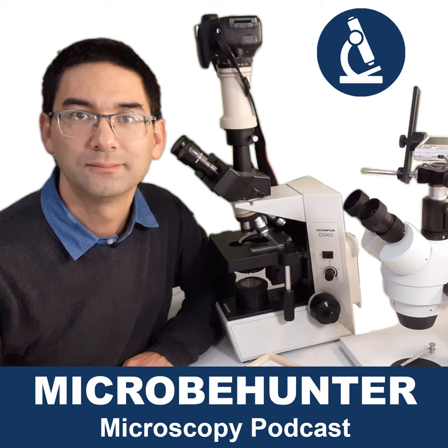I remember a talk I once had with a representative from a microscope company, and he told me that in the laboratory they rotated a very expensive dry, non-oil objective into the immersion oil, which should not have happened. It's a very, very expensive objective, and they had to take the objective apart to clean it because some of the immersion oil actually got behind the lenses.